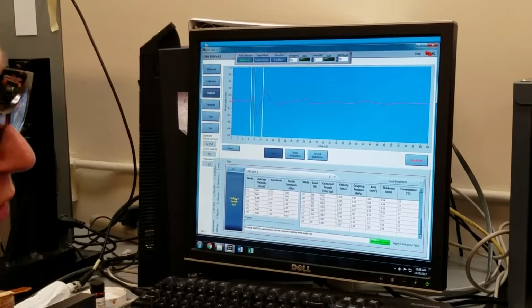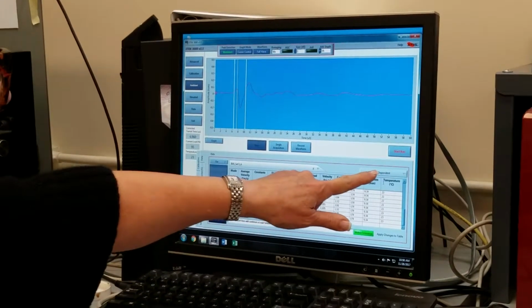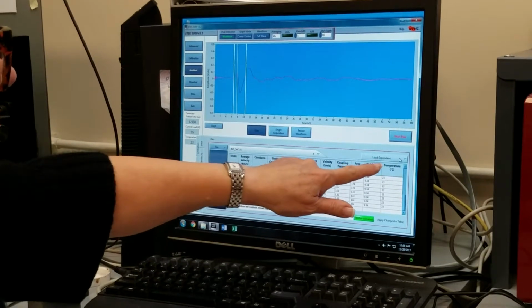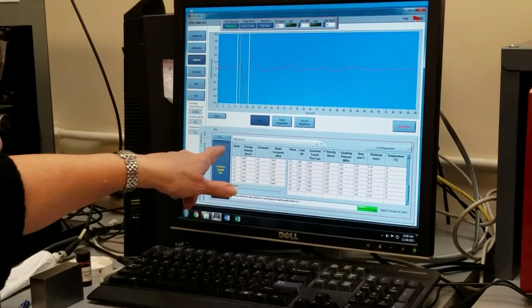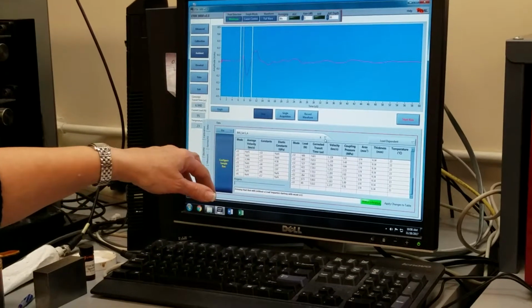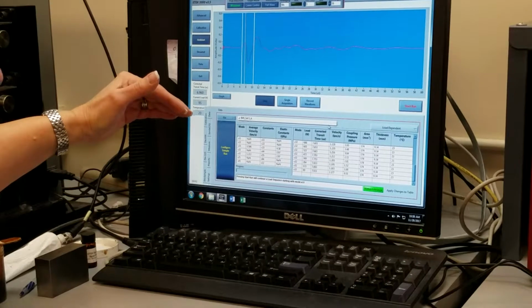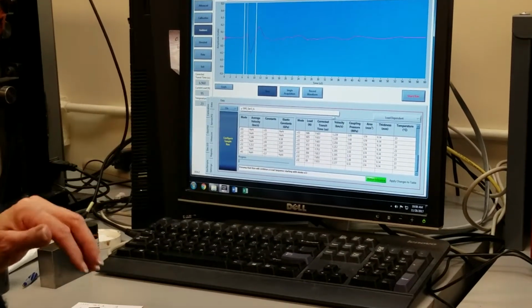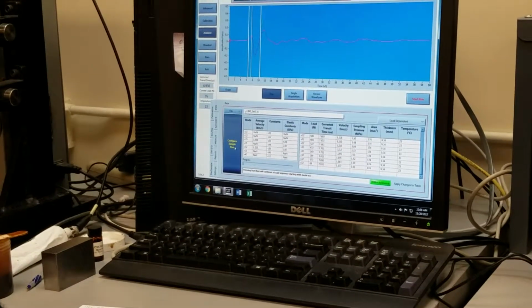and we need to reconfigure the sample for the ambient measurement. If you notice on the right portion of the screen, it says load dependent, and we just made that measurement. And if I had set up the B and C sample by clicking this down arrow key here, we could also select a second sample to make the load measurement on. But we're going to go on and now select the ambient measurement.